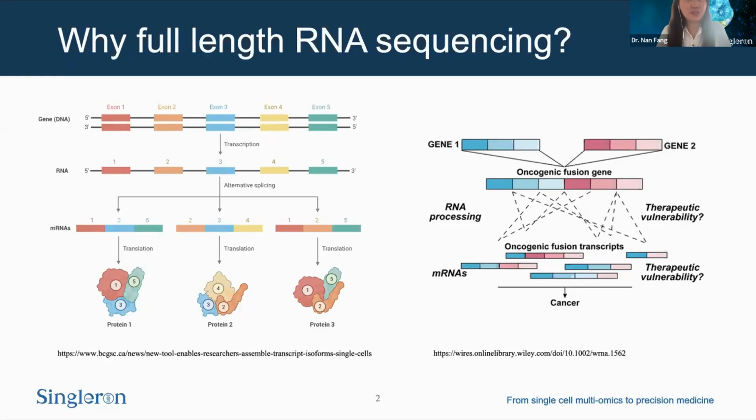With the quantity information, we can then annotate cell types, discover new cellular states and new subtypes, and compare their pathway activations, depressions, upregulation of genes, and downregulation of genes. Those are already very useful information, as we all know.